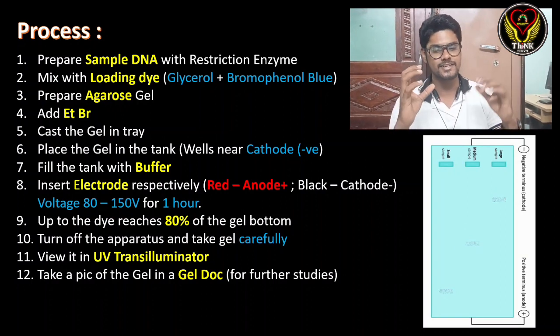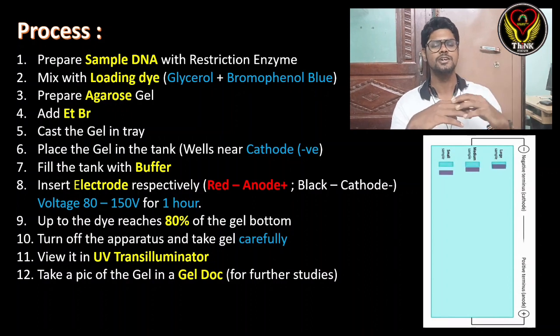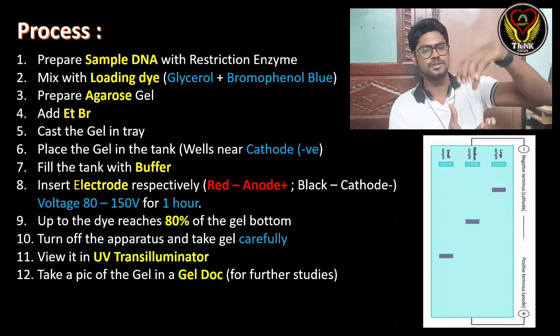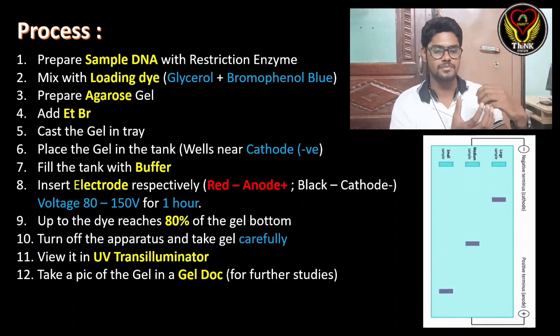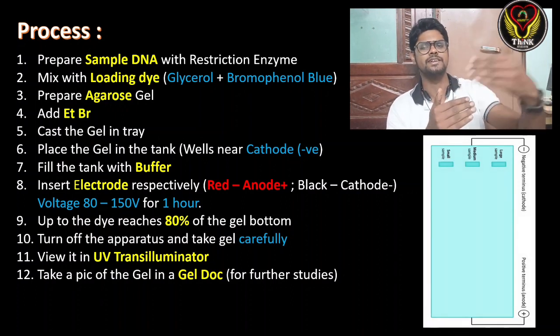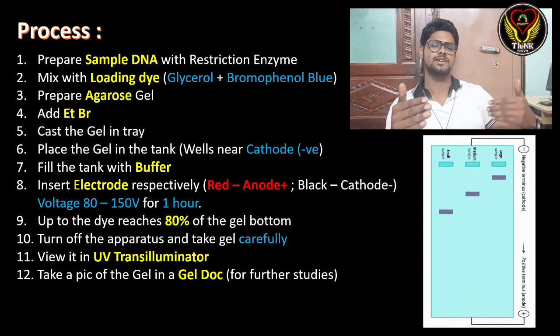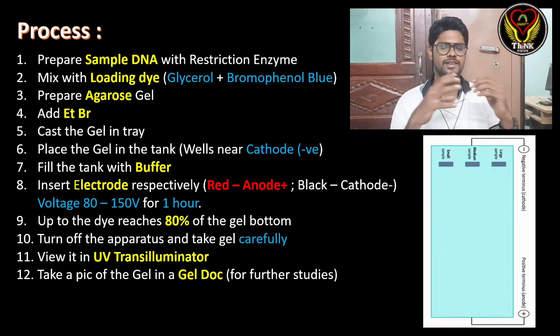Sixth is to place the gel in the tank with the wells near the cathode. While placing the gel in the tank, we have to keep the wells near the cathode, near the negative charge, because from the wells only the DNA will start moving. Then fill the tank with the buffer.